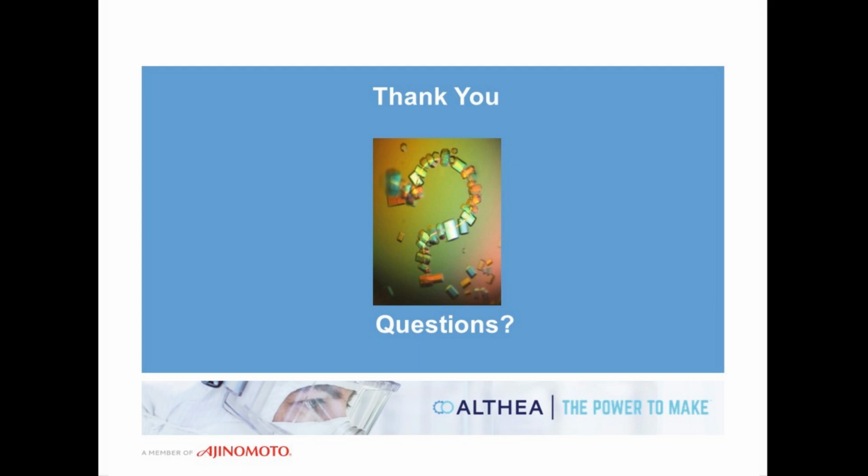Thank you very much, Jonathan and Lynette. Yes, we do have some questions, so let's get started with them. Our first question is from Allison. For crystallized drug product formulations, do you see an increase in soluble and insoluble aggregates upon dissolution of the suspension?